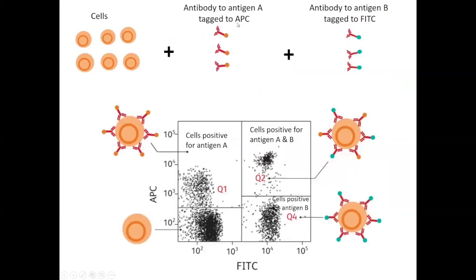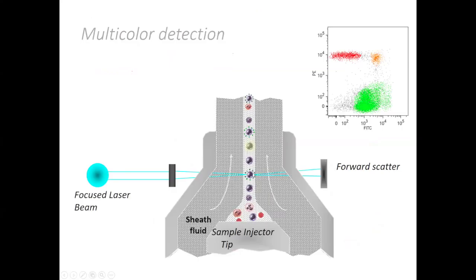Here again, 2 fluorochromes are stained, they attach to the cell, and you get data like this. This is positive for both, this is negative for both. This is positive for the y-axis marker, here it's APC, which is the fluorochrome allophycocyanin, and here it is positive for FITC, which is fluorescein isothiocyanate. That's how it beautifully happens. This animation shows a cell which is stained only with green fluorochrome, so green falls here. When it is stained with only orange-red color, it falls here. Similarly, data is processed like that.